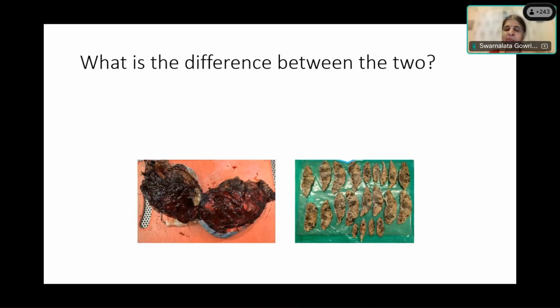So very, very important that whatever else you may forget, please don't forget buffered formalin, 10% neutral buffered formalin, and make sure that that is used no matter what your tissue is. It's a regular hysterectomy, regular gallbladder. It's a very valuable tool. For all specimens, you must use neutral buffered formalin. So we go to the next.